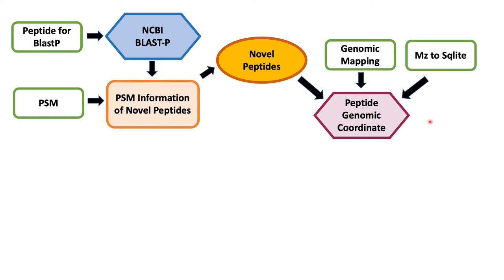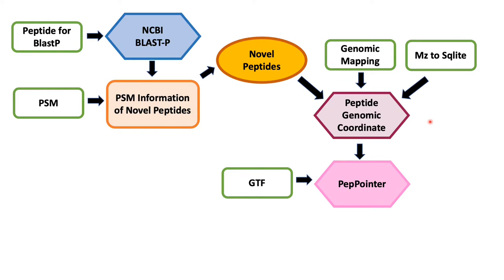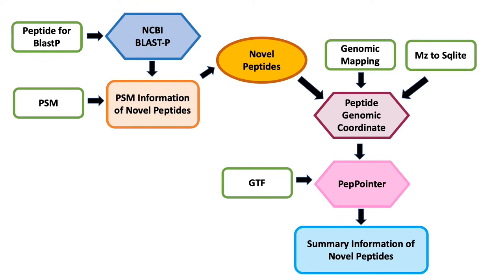To perform strand analysis and get more information about genomic localization, we have used a new tool called PepPointer. For PepPointer, the main input is your GTF file, which is the output from your first workflow, and the peptide genomic BED output. Once you get the information about your peptides, we have used QueryTabular to get a complete summary of your novel peptides — basically the information about the peptide, the protein it comes from, the file it's present in, and a link to the UCSC browser.